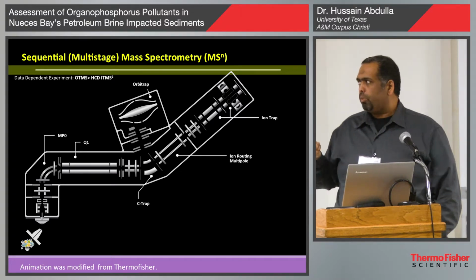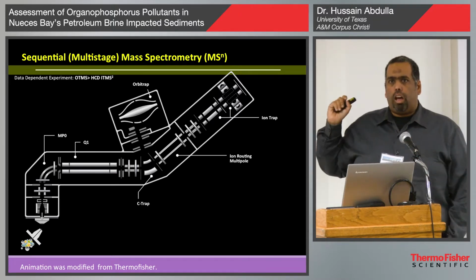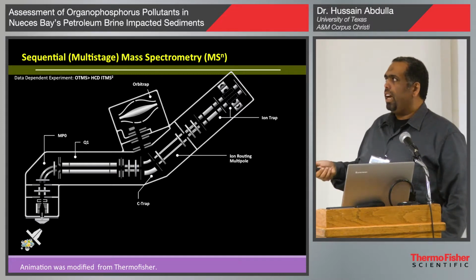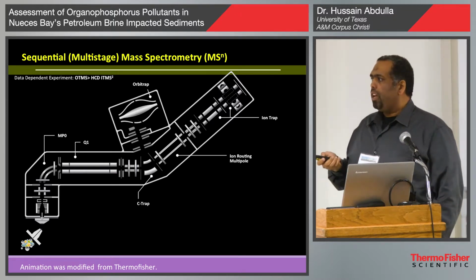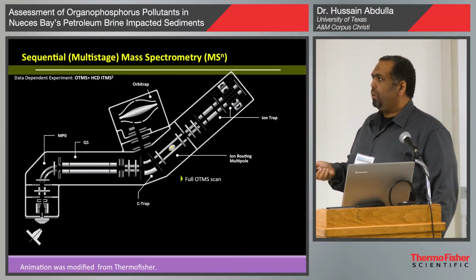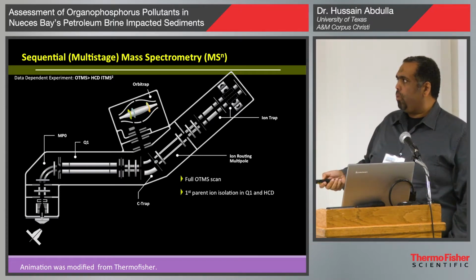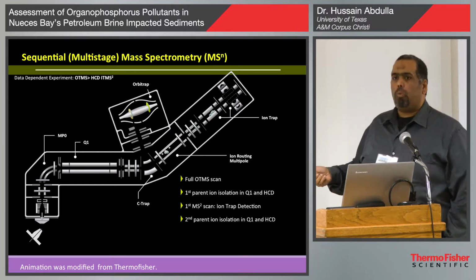What we are doing right now, we still do not have the data because I have had the instrument for only 3 months, but I'm using the Fusion Orbitrap. The Fusion Orbitrap, as I said, is high resolution, 500,000 resolution. But the other interesting thing is it has 2 mass detectors. It has the Orbitrap, the high resolution, and it has the Ion trap, and both of them can work simultaneously at the same time. So we can do a full scan through the Orbitrap. As we're doing a full scan in the Orbitrap, we can select some of these ions and fragment them through the HCD and detect them with the Ion trap. At the same time, we are detecting a full scan.